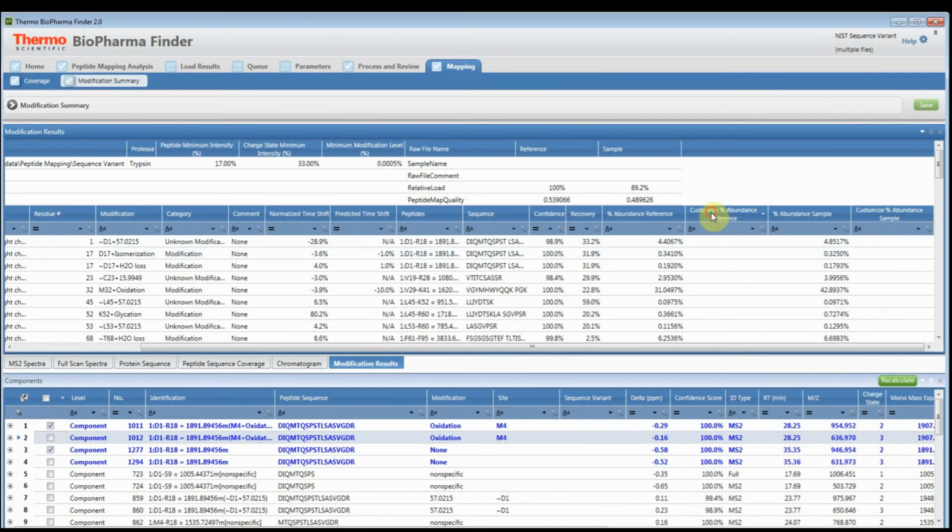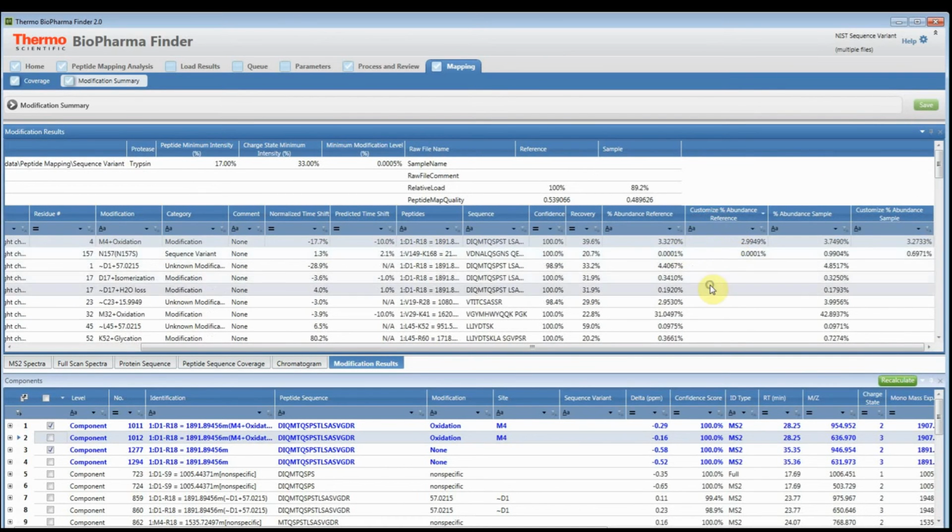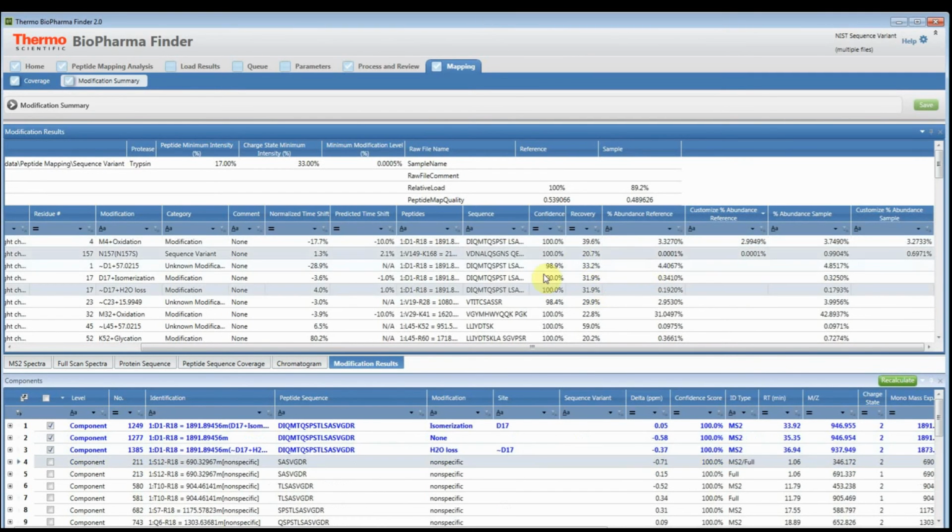And then when you come, you can sort by the new values. You can also export this, and it will show your customized values. Now, the other thing is it won't remember what you've done. So this is pretty manual at this point.